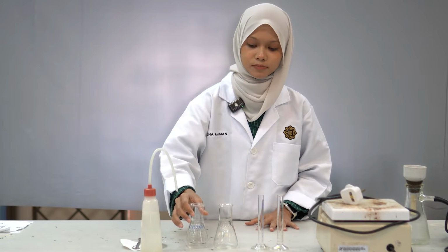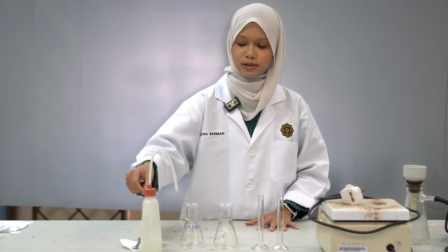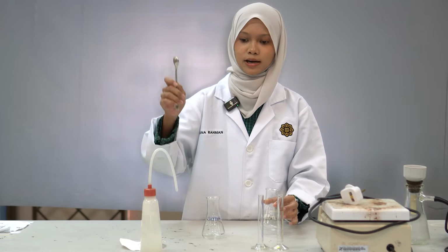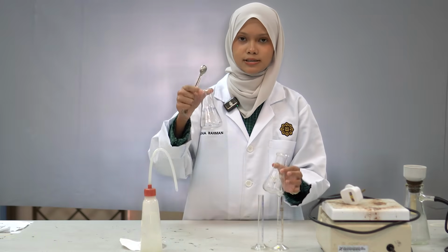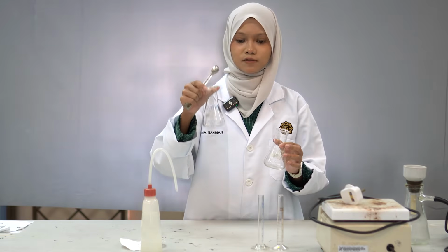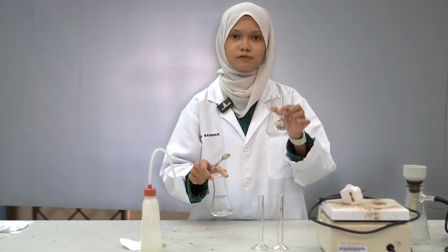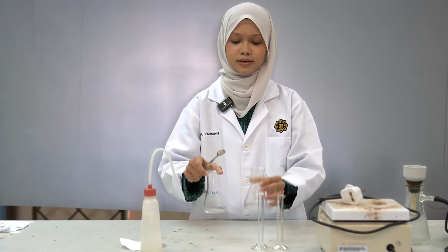So first, we're going to put our dry acid precipitate using the spatula, adding half into the single solvent flask, and the other half into the mixed solvent flask.